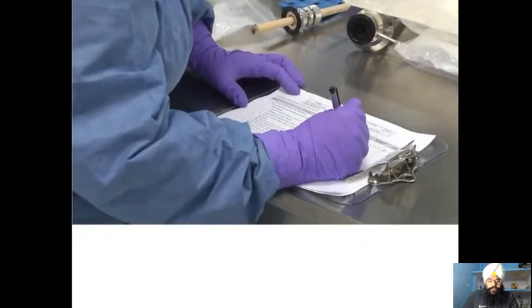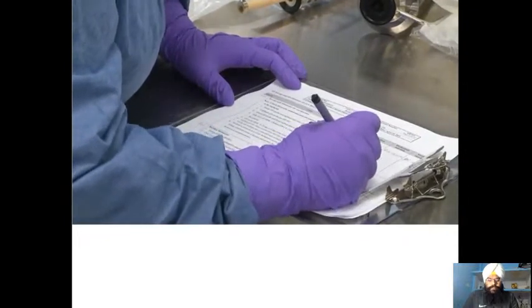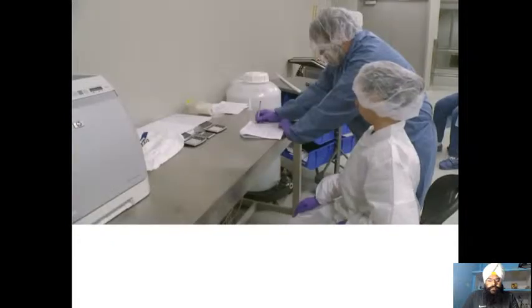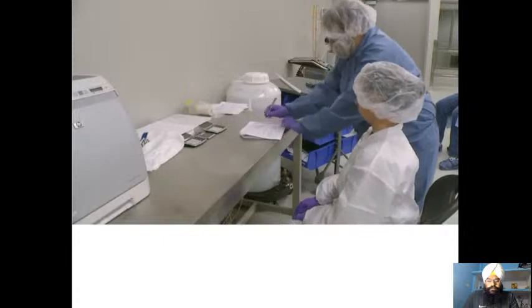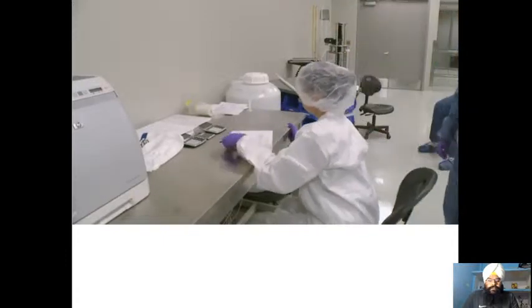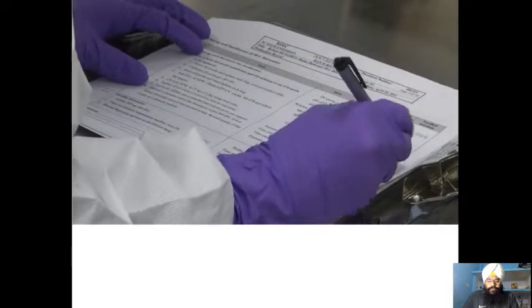The purification process is managed through the use of a batch record. There is a separate batch record for each processing operation. These documents lead the operator through the process step by step, with each step requiring a sign-off and separate verification by a second operator. The batch record also includes spaces for documenting times, activities, operation steps, and instrument readings.